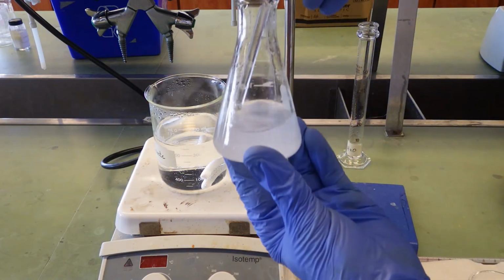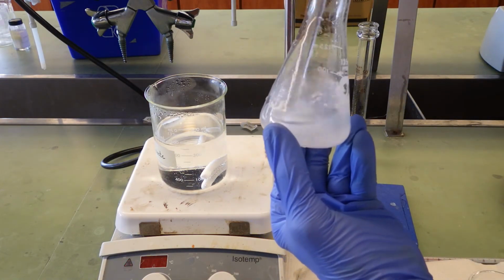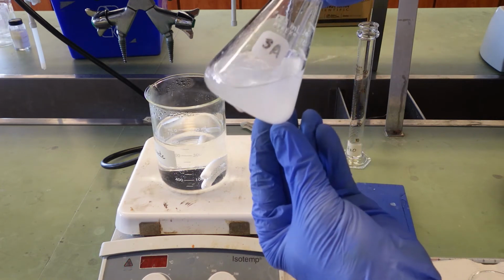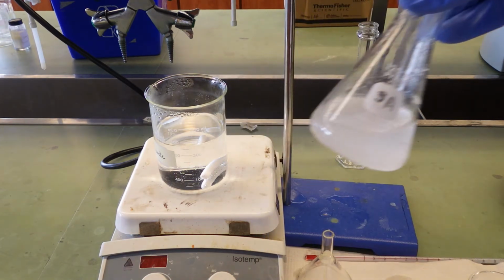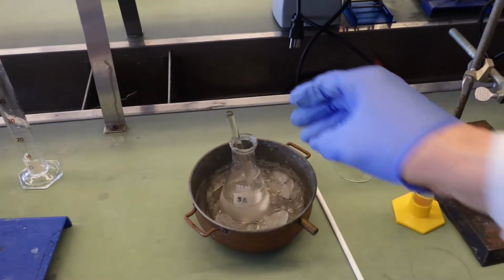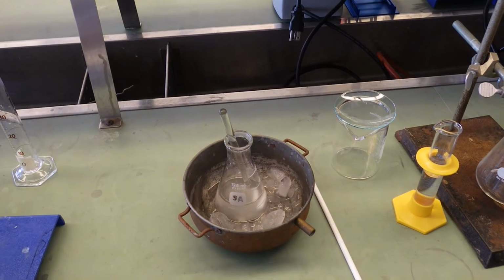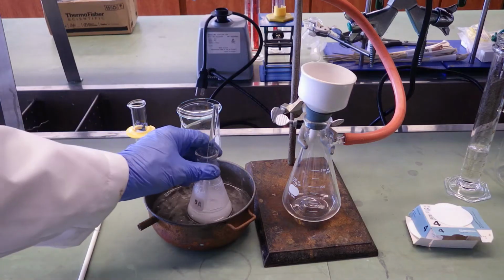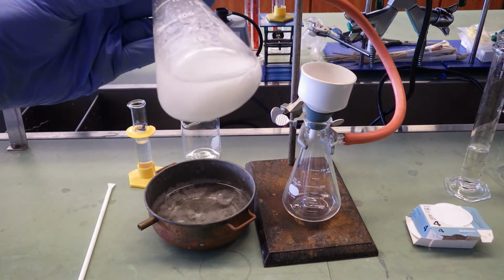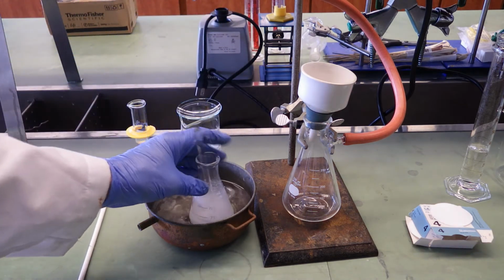No, just an emulsion of two oils. We have to get it out of solution. Let's put it in the ice bath, and I'll keep scratching the bottom of the flask. Well, after about 10 minutes of cooling and scratching, we do have a healthy crop of crystals.